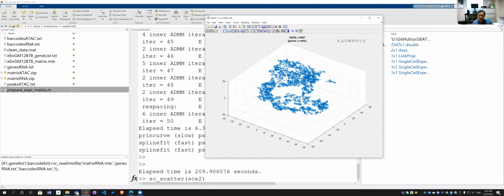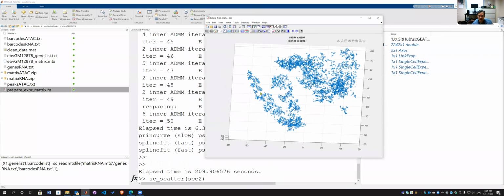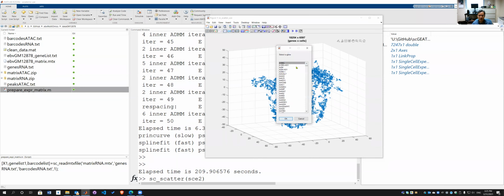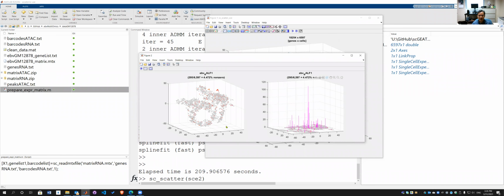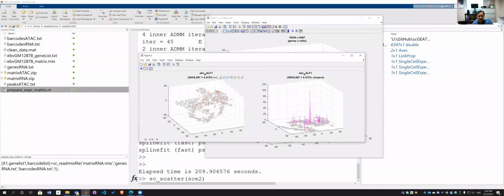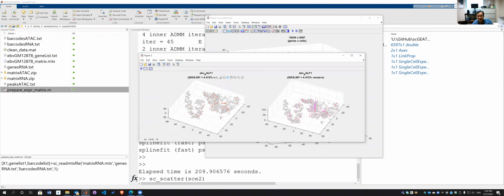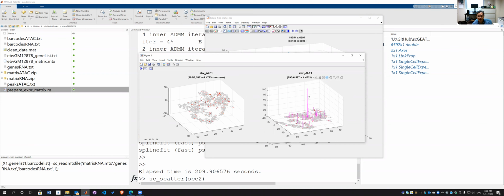So, okay, in this session, I'm going to show you the expression level of the virus. So that's the host cell, and then if you look at the gene expression list, at the very bottom, we have information on the EBV viral expression. I don't know which one I should look at, but I select this one. You see this gene from the virus, it's called EBV BALF1. Okay, BALF1 is expressed in 4.47% of cells. You can detect its expression in 295 cells. Some of the cells have this level of expression.